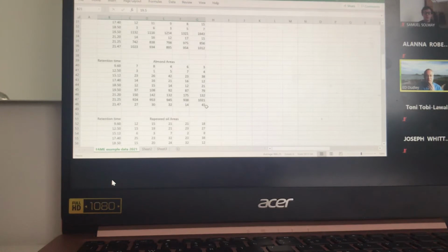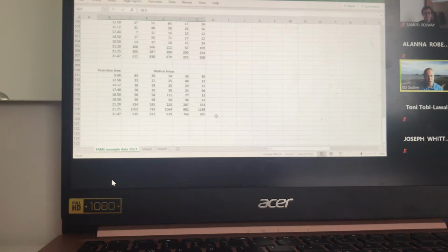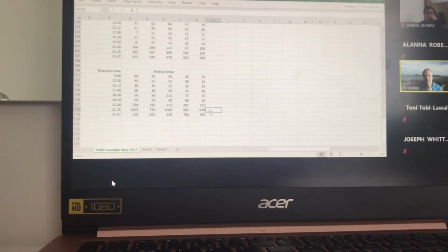Now, in principle, we don't want to have 5 sets of data for every sample. So we want to just use the average. So we want to take the average of these, so we've got one value, one number for each retention time or fatty acid for each sample. The problem with that is that if you look at the values across, let's take this one for example, one fatty acid in 5 different extractions from the same food, you get very different levels of that lipid in terms of the numbers.